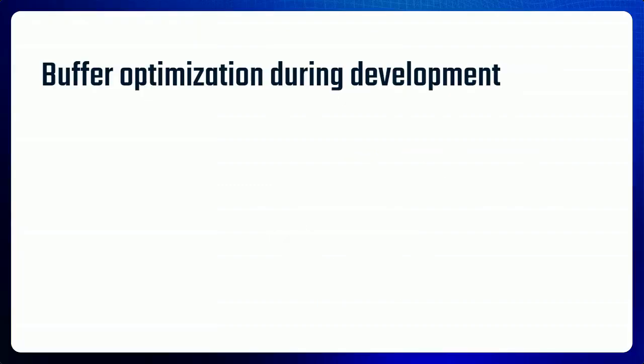Now, I've been talking about buffer formulations in general terms, but before we get into the data, I'd just like to go over some terminology and where these types of experiments fit in the biologics development workflow. Pre-formulation and formulation mean different things and have different objectives depending on where you are in the development process and your group's goals.